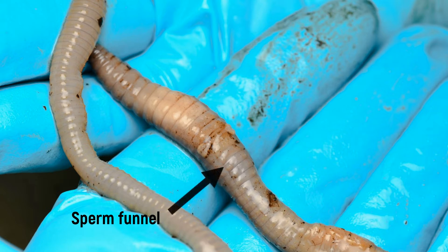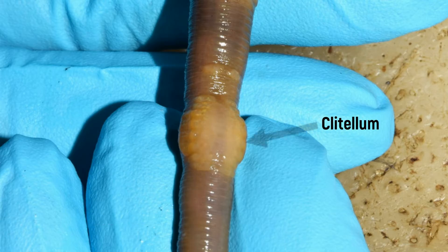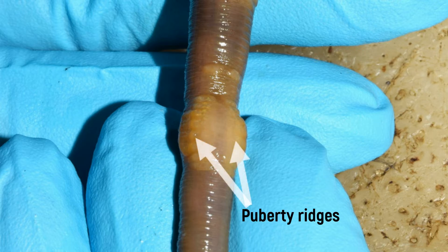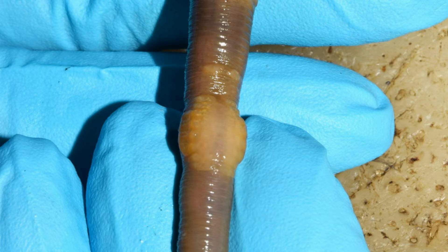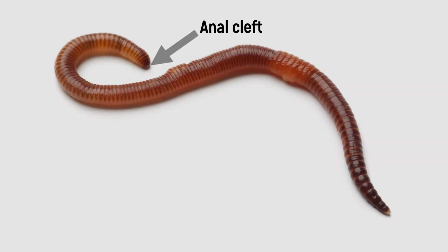From there, a funnel extends which is used for sperm cell transport. This sperm funnel extends to the clitellum. The clitellum extends over segments 32 to 37, and is saddle-shaped, with bulges on both sides of the abdomen — the puberty ridges. At the end of the body, the pygidium, lies the vertical anal cleft.